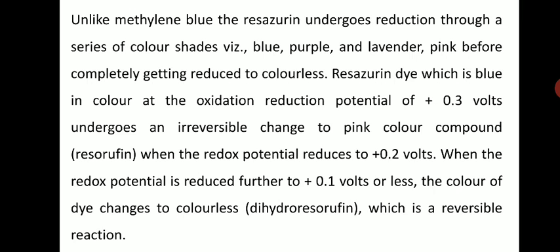In the case of methylene blue, we had seen that the dye directly gets decolorized to colorless, but here in the case of Resazurin there are different shades of color we can observe as time goes on and reduction gets started.